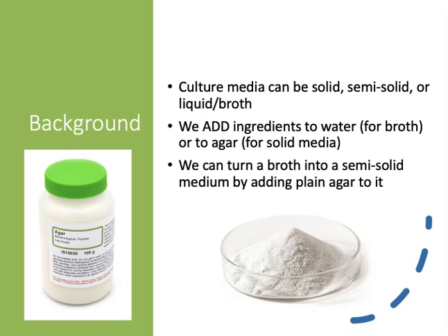The type of culture media that we use in the microbiology lab can be solid, semi-solid, or a liquid or broth. We can add ingredients to water, for example, to create a broth. And we can add ingredients and agar to water to create a solid medium, the type that you would find in an agar plate. We can also take a broth medium and turn it into a semi-solid medium by adding a little bit of plain agar to it.